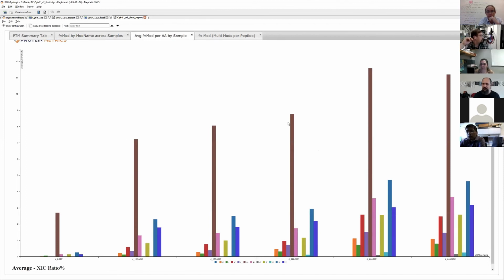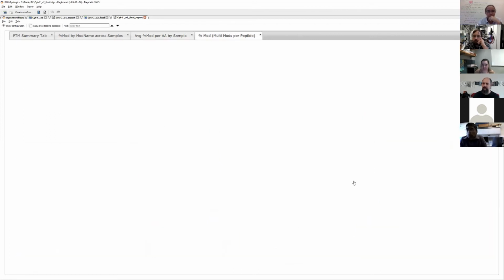Finally, you can make the same report look like a bar chart or average across different residues. So this is in the default report. Again, it actually shows you the average modification found in a particular residue type in the sample. So this largest one here is methionine, which is expected. And the average methionine modification is different in each sample, and it changes. So this is not site specific, but looking at all methionines at once, particularly useful. I didn't plug in a PDB file here, but you can, and you can map this kind of data on a PDB file, as Sinjan showed.